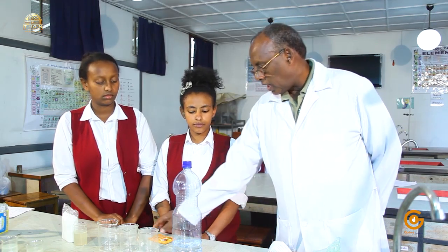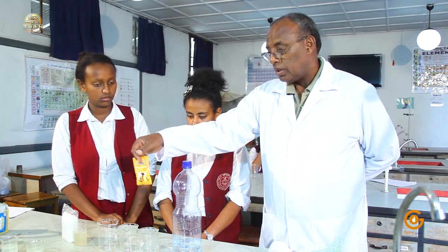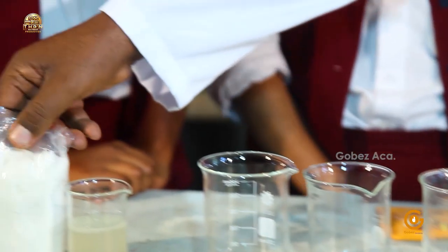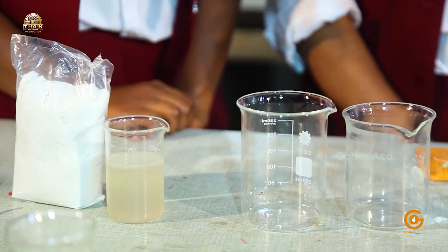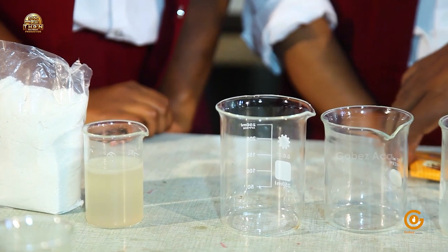So we have baking powder. It is sodium bicarbonate, sodium hydrogen carbonate, and also sodium chloride. Both made for human consumption. We bought them from the stores.